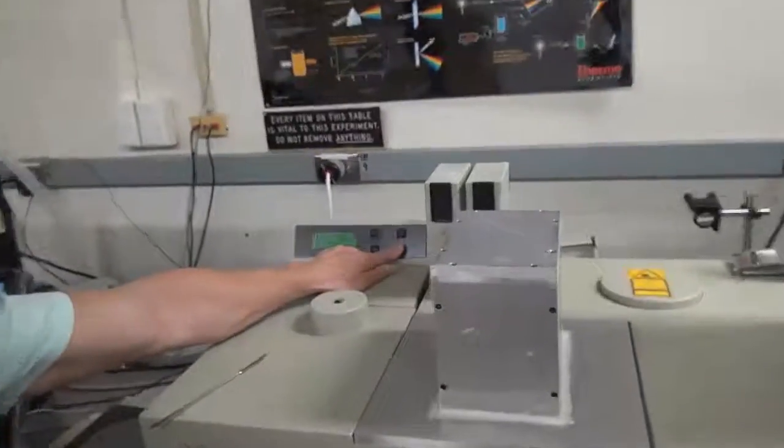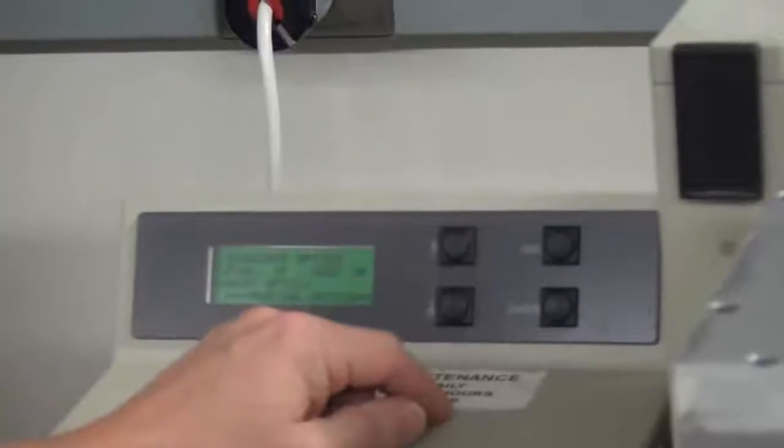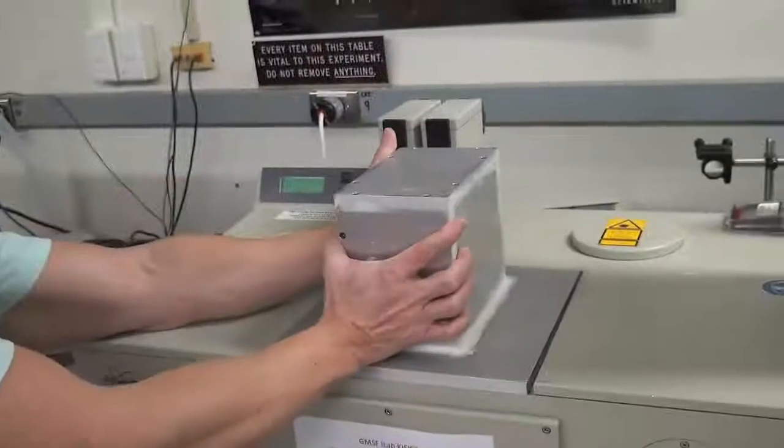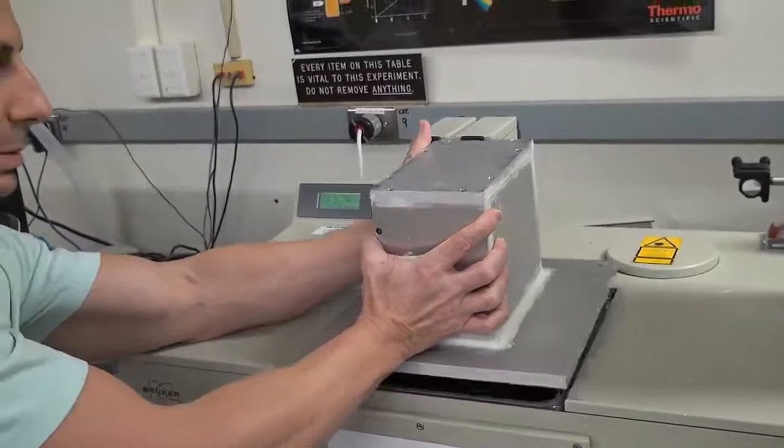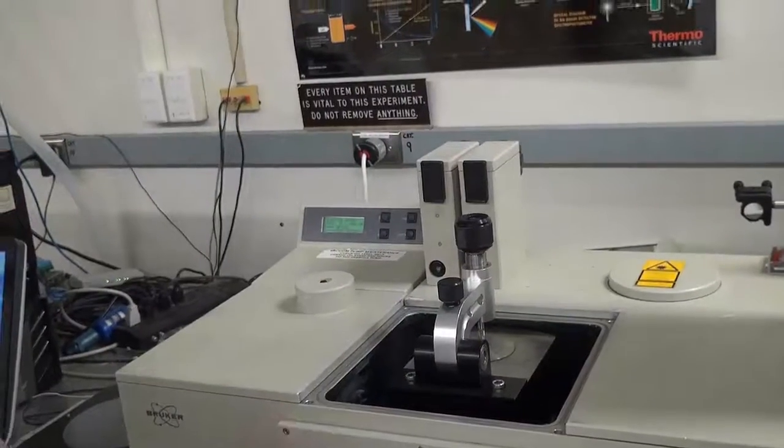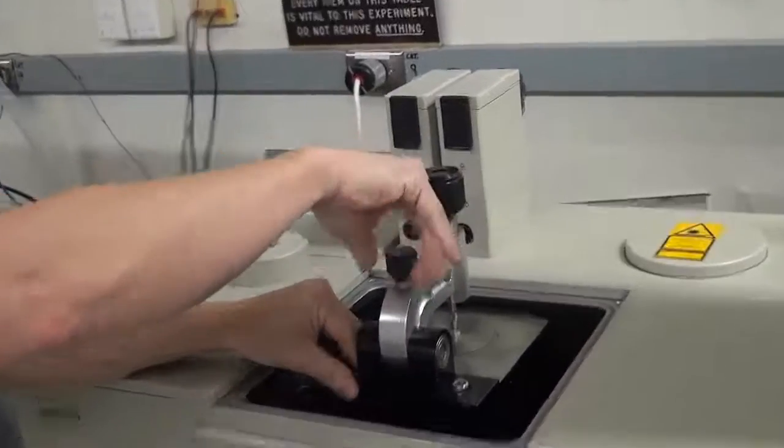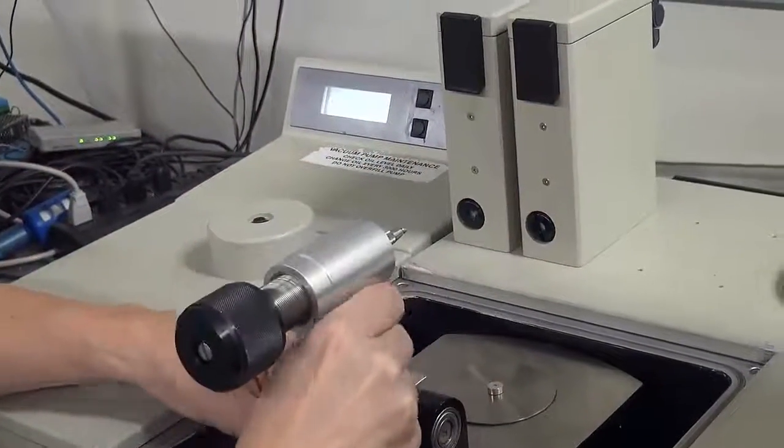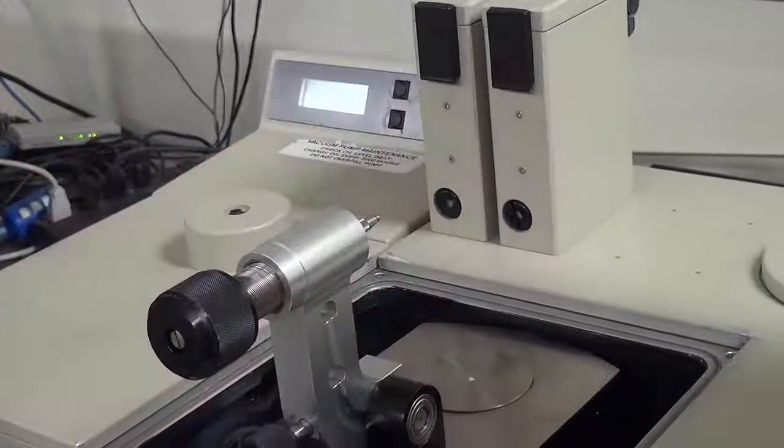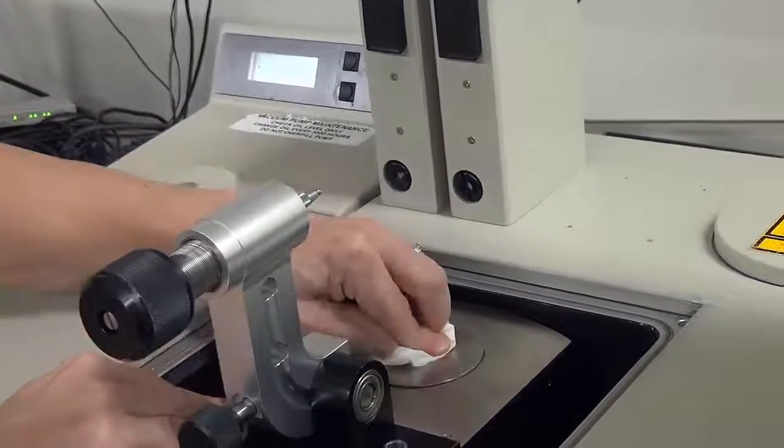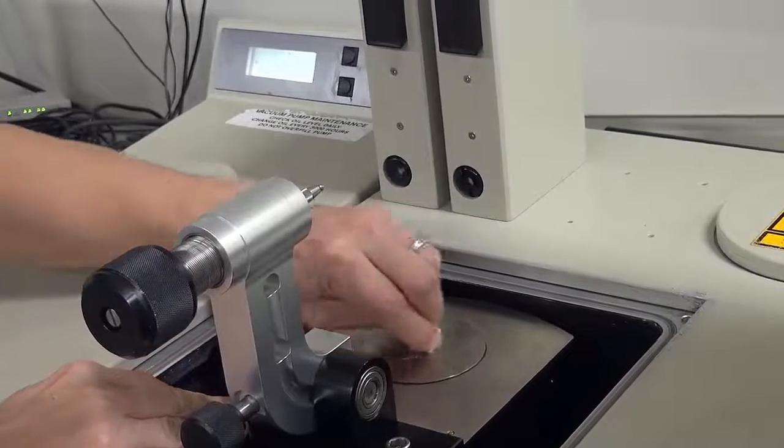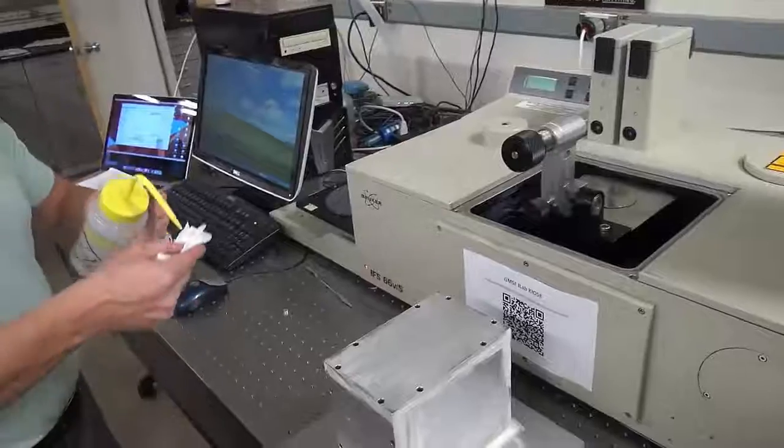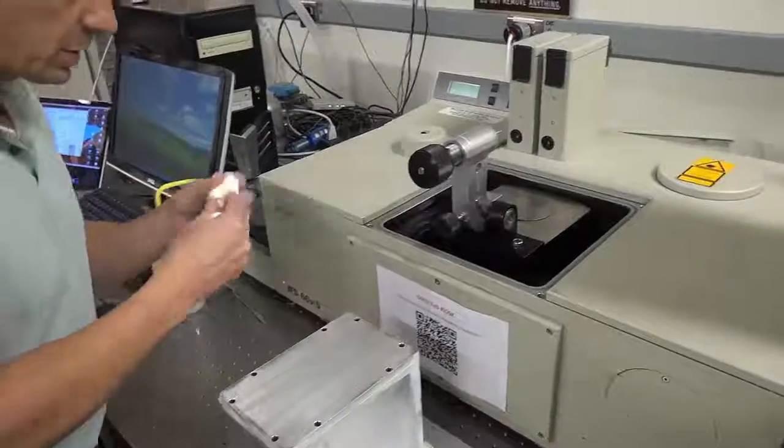Now you need to clean off your sample. So vent the optics. Lift the lid. Lift the arm up. And wipe off your sample with the chem wipes.